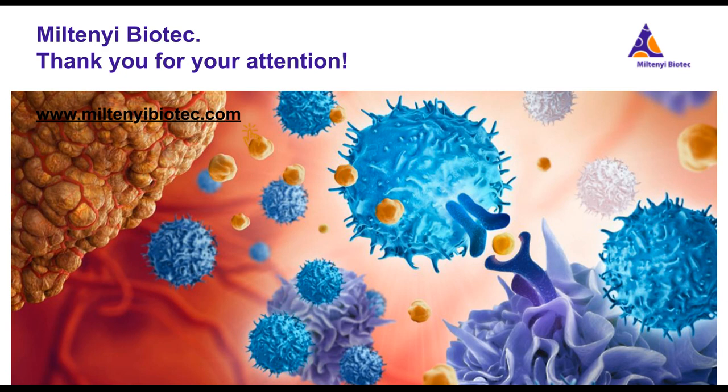Could you please quickly explain how the MACSprep PBMC isolation kit works? The isolation of PBMCs using the kit is performed with only one labeling step, and in a two-step separation procedure. During the first isolation step, erythrocytes are aggregated and sedimented, and then in the second step, the PBMCs are isolated by the depletion of non-PBMCs, so neutrophils, eosinophils, platelets, and residual erythrocytes. By this, you will isolate untouched PBMCs.